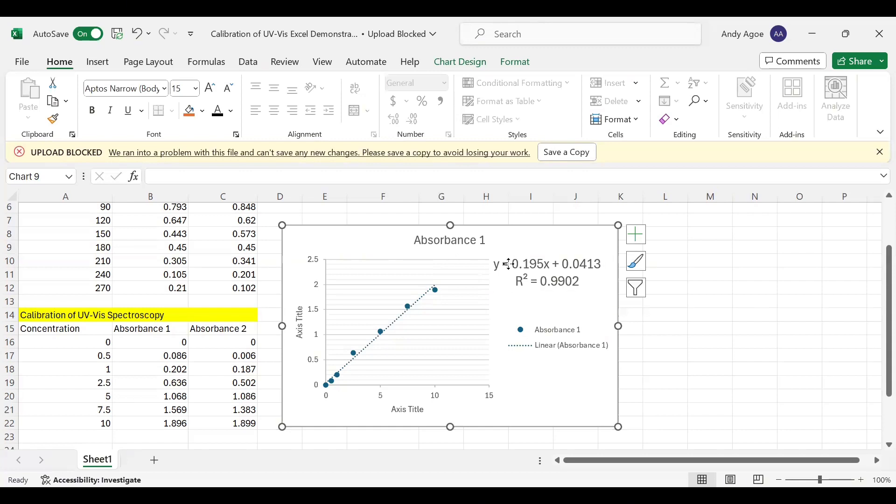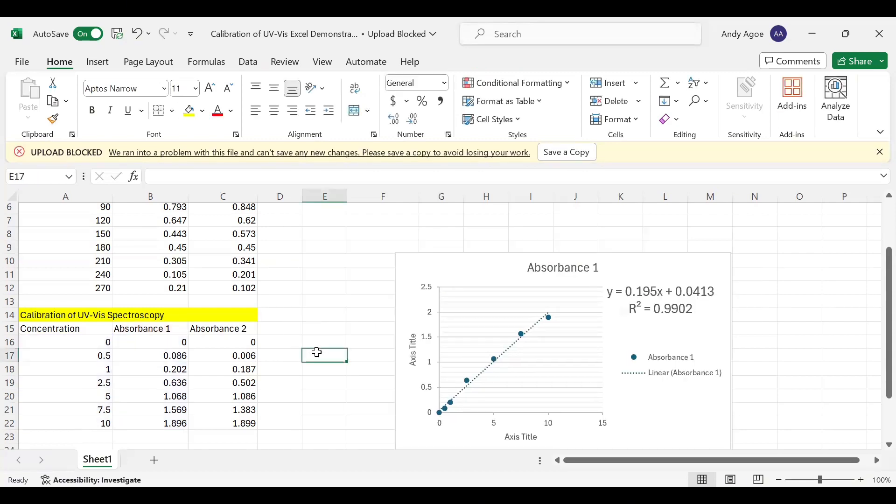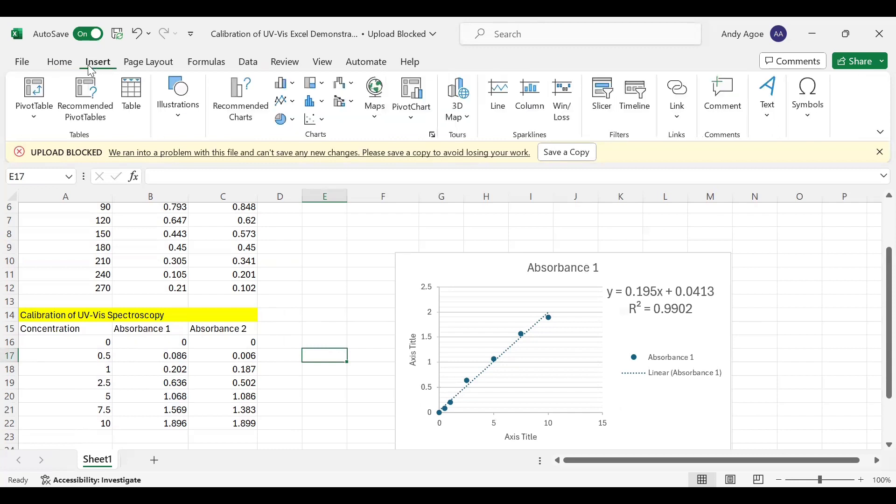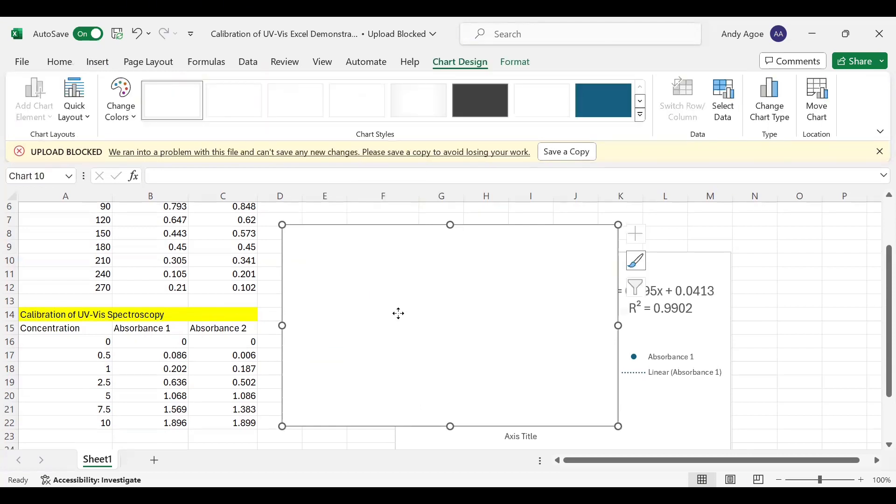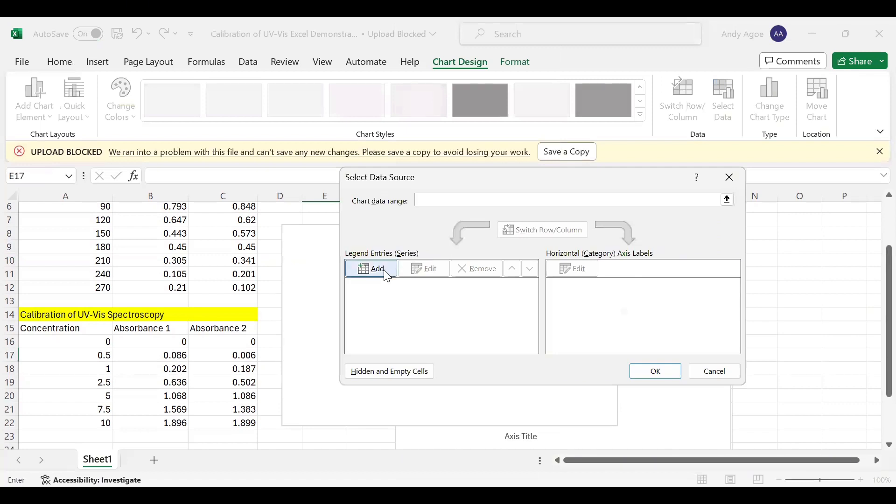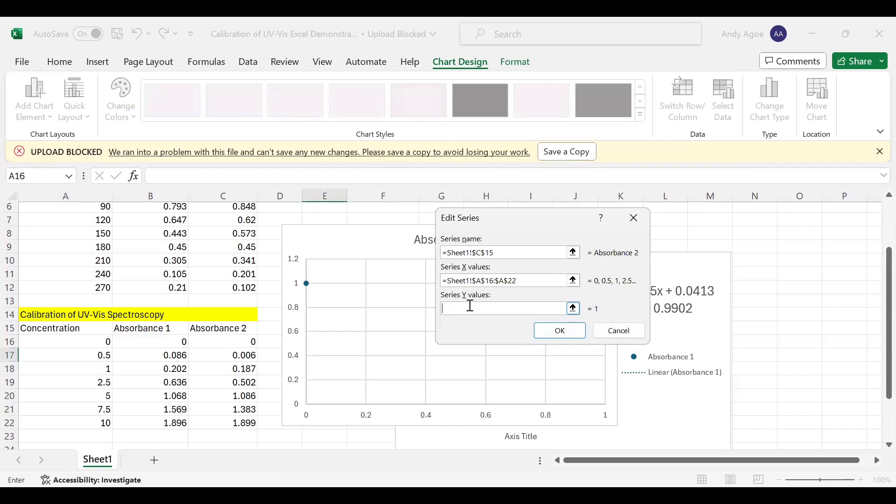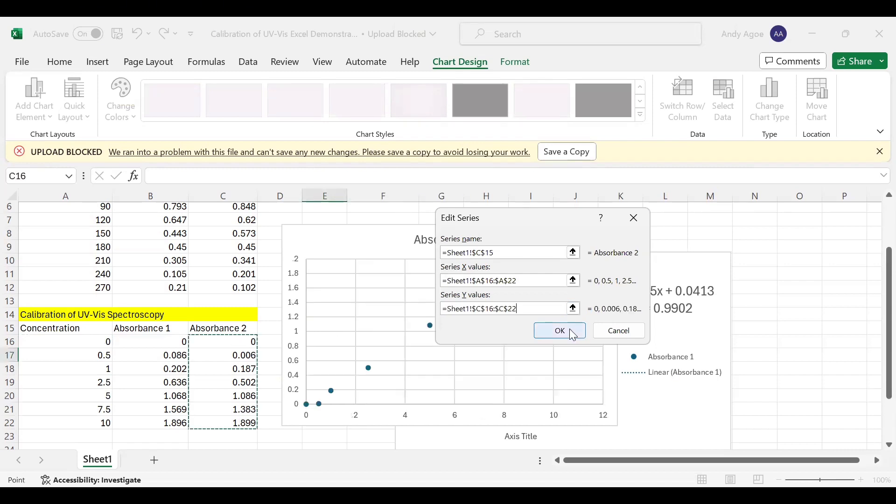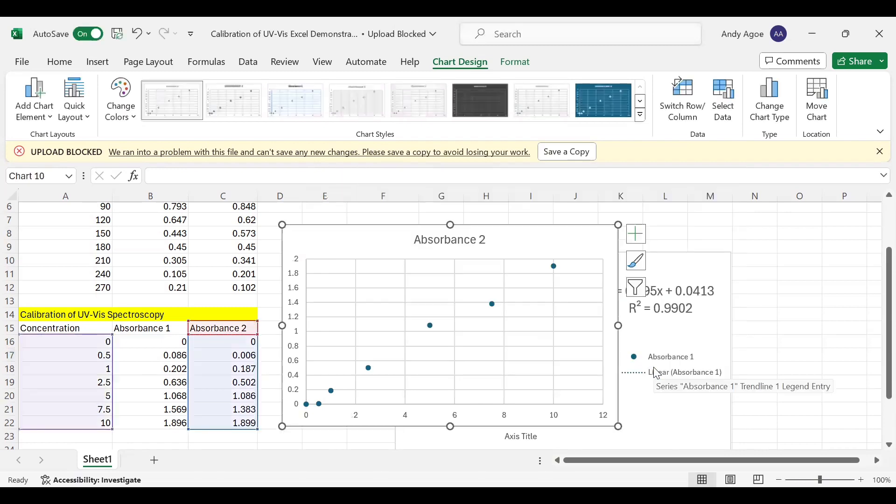Let's do the same for Absorbance 2. You select an empty workspace, then move to Insert, go to your Chart, select Scatter, click on the plot area, then click Select Data, move to Add. Now the series name is Absorbance 2, your X values is concentration, and your Y values is Absorbance 2. Then you click okay.